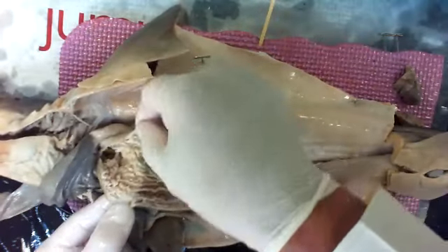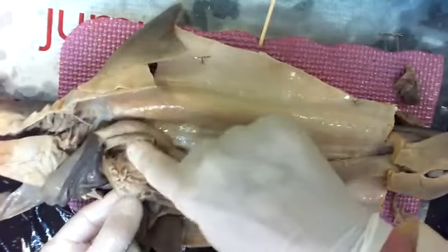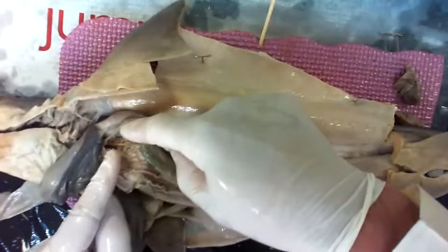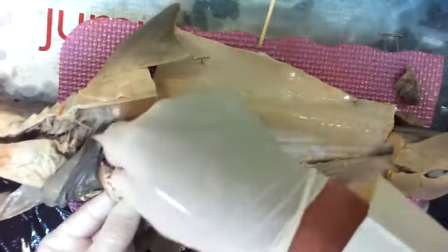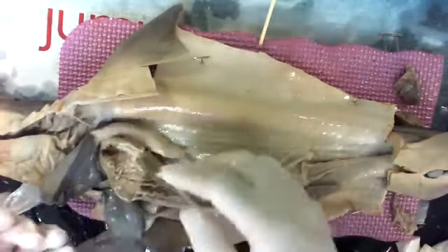If I go up and open, look at that. It's not the same. There's my probe. See the probe right there? It wouldn't stick. Look at the wall of this area. They're not lines. They're the finger-like projections.